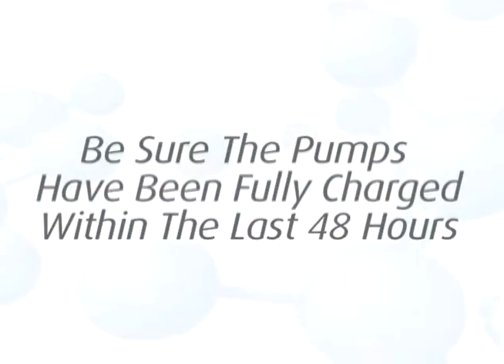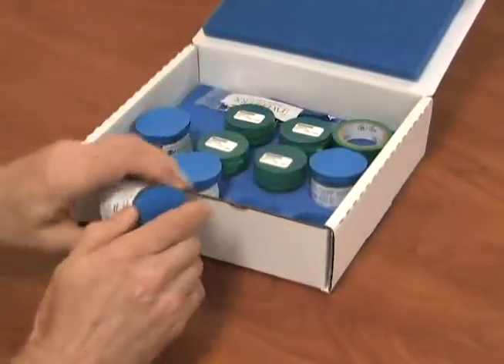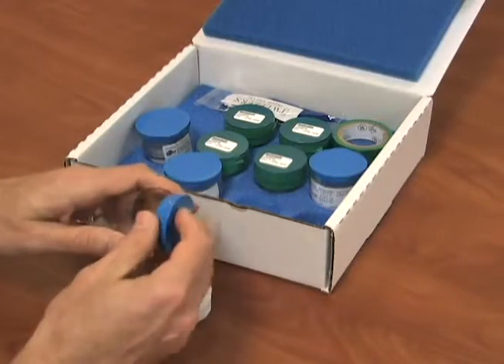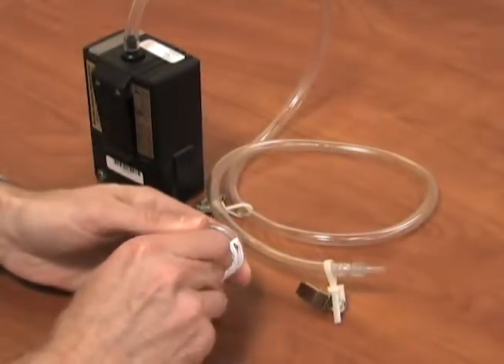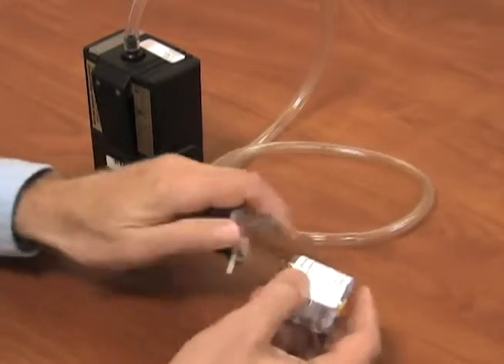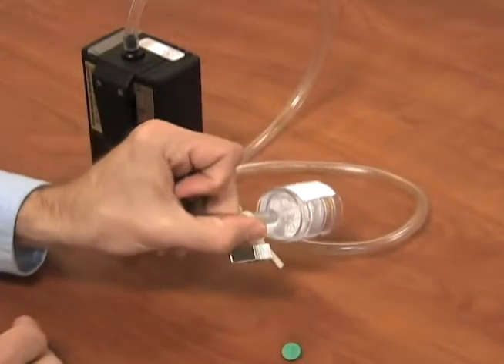Remove the cassette from the shipping container and be sure to keep all packing material for return shipping. Remove the colored nib from the wagon wheel pattern side of the filter cassette and attach it to the pump tubing. Be sure the wagon wheel pattern is facing the pump.